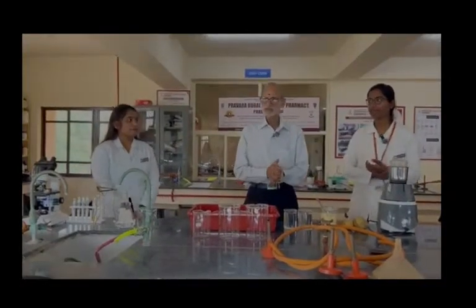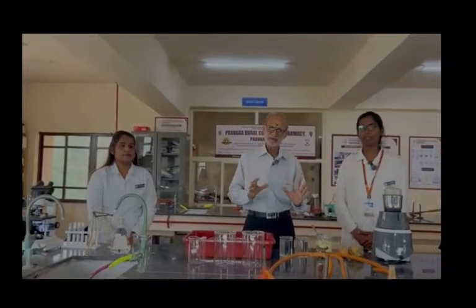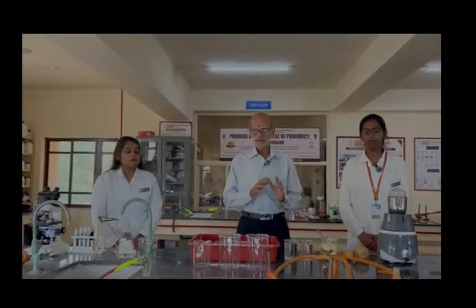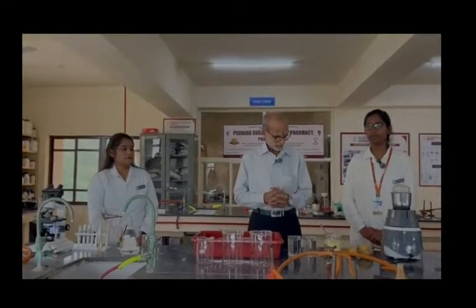We are going to begin with the very first experiment, that is separation of starch from potato. Let me give some idea about the starch. Starch is extensively used in the industry, whether it is food industry, pharmaceutical industry, textile industry, or the paper industry. So starch really has good importance in society. And we are going to begin.